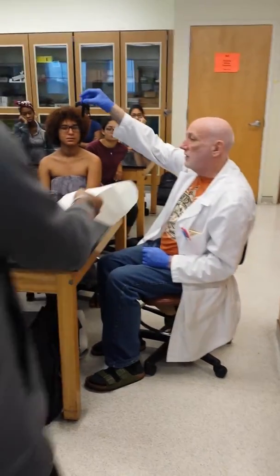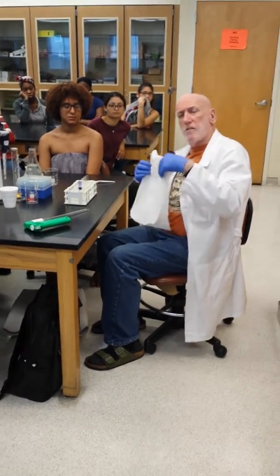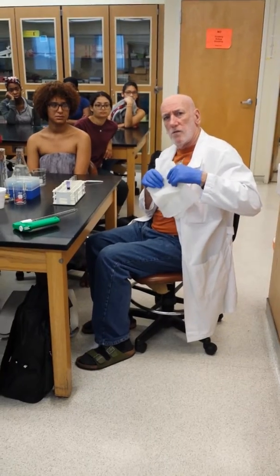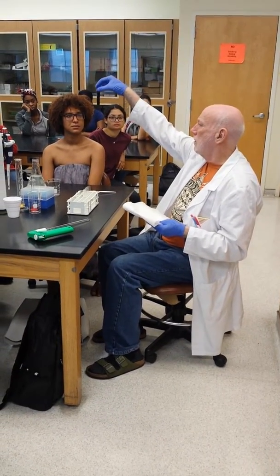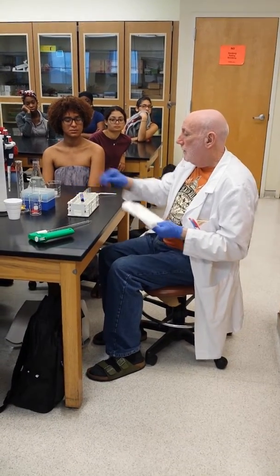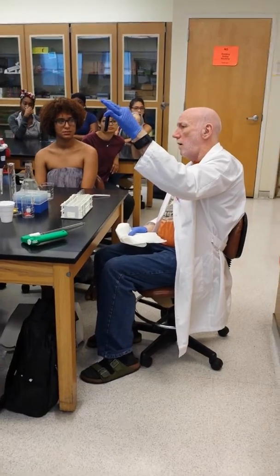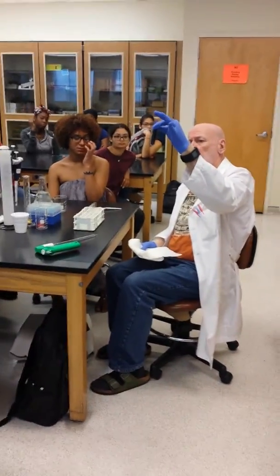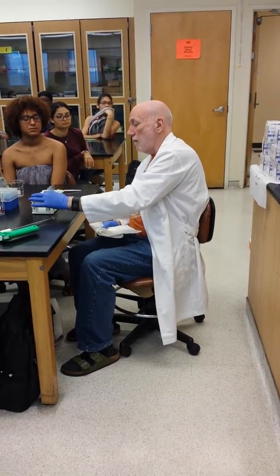Yeah. This is a very concentrated solution of, it's a potassium permanganate we used? The crystal violet. Crystal violet. And it's got a very dark purple color. I'm going to call this a stock solution. Let's pretend this is a 1 molar solution. A stock solution, 1 molar. Got it? It's very high concentration.